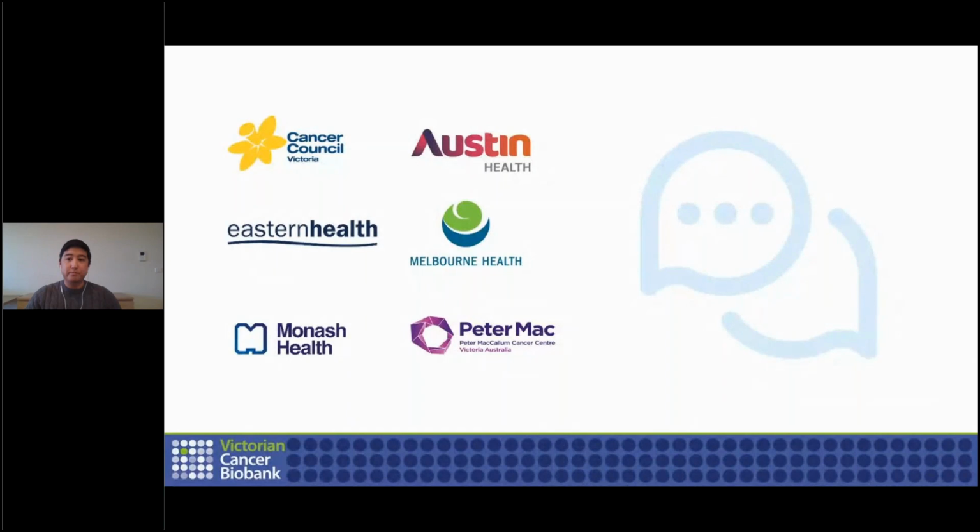Duncan, anything to add about standards or validations? No, I think you covered it well, Sri. The validation, the edit checks that we've implemented really help in terms of this, and you can get quite granular. You can ensure that different fields, not within the same form, but within the entire database, correlate. Sure. And Wayne is asking, would love query power to improve. Yeah, sure. I think he's talking about the improvement part.